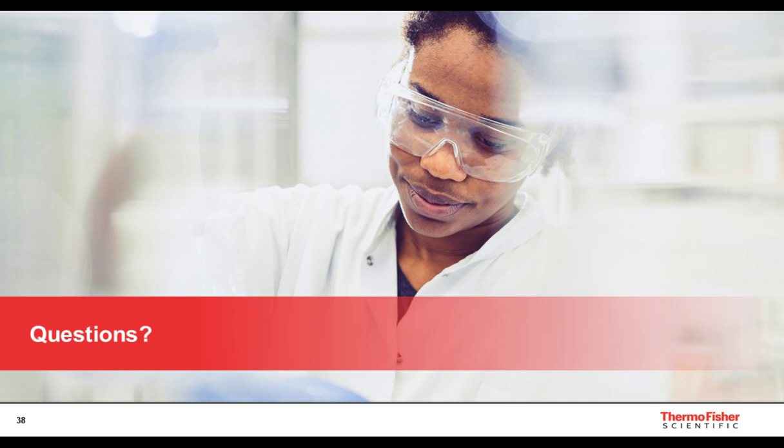Thank you. Our next question: is there a particular reason why you added GFP into the CB2 and the A2AR constructs? So yes and no. We had that construct, I think, for another purpose, but we decided to use it because ultimately we wanted to hopefully extract and purify protein that could go into cryo-EM studies.